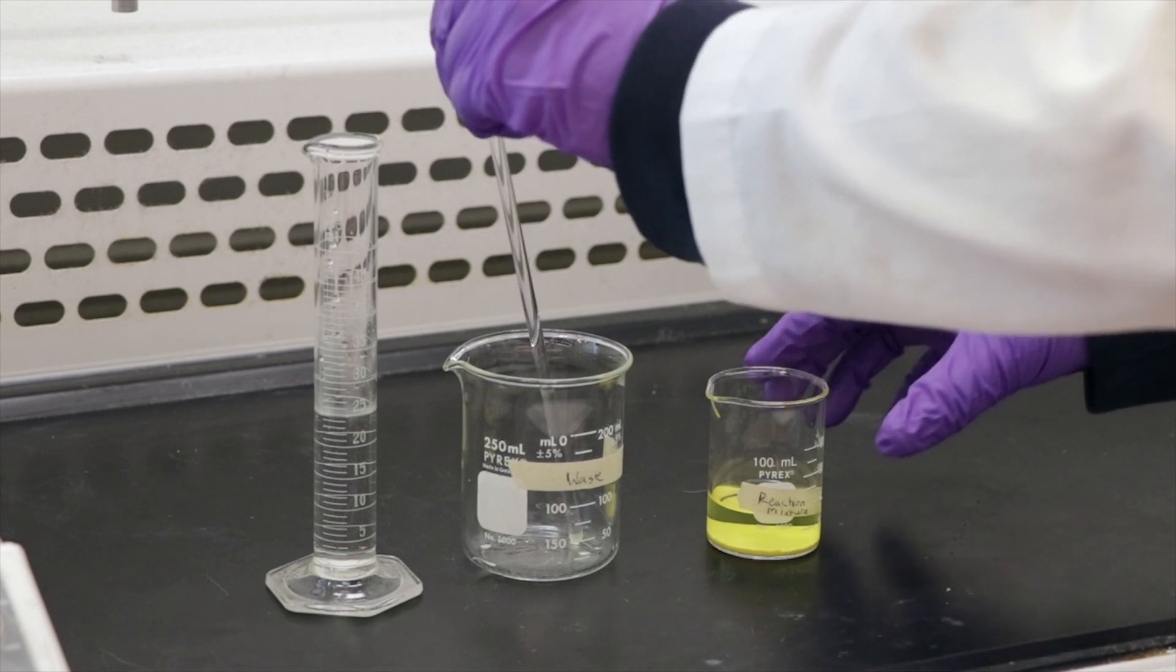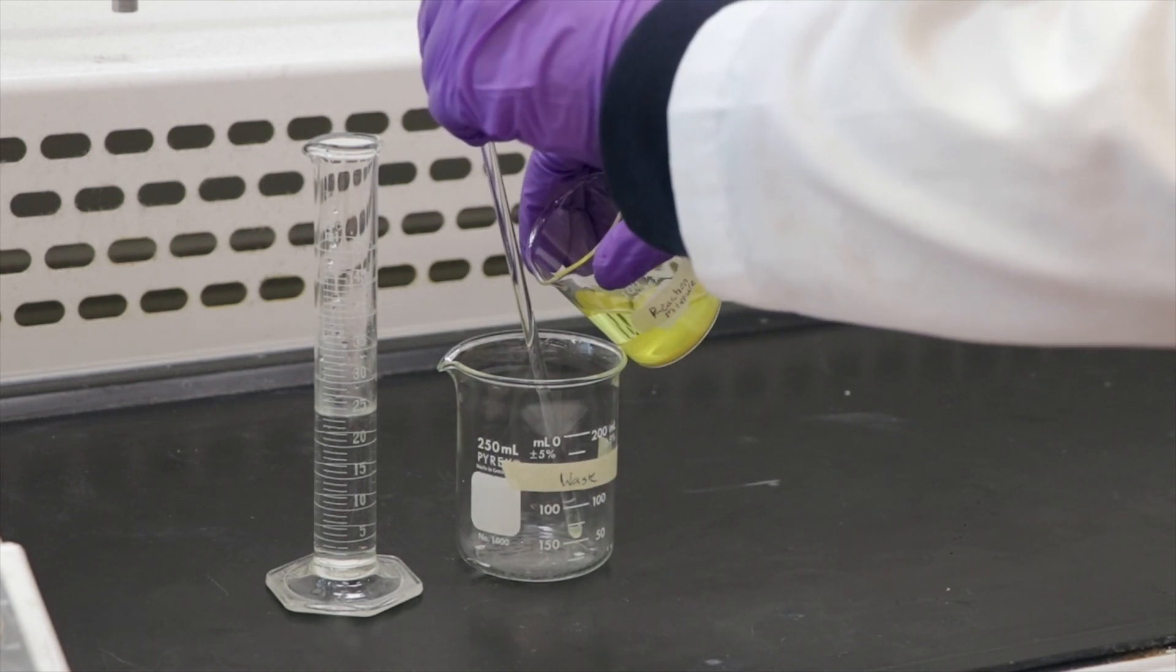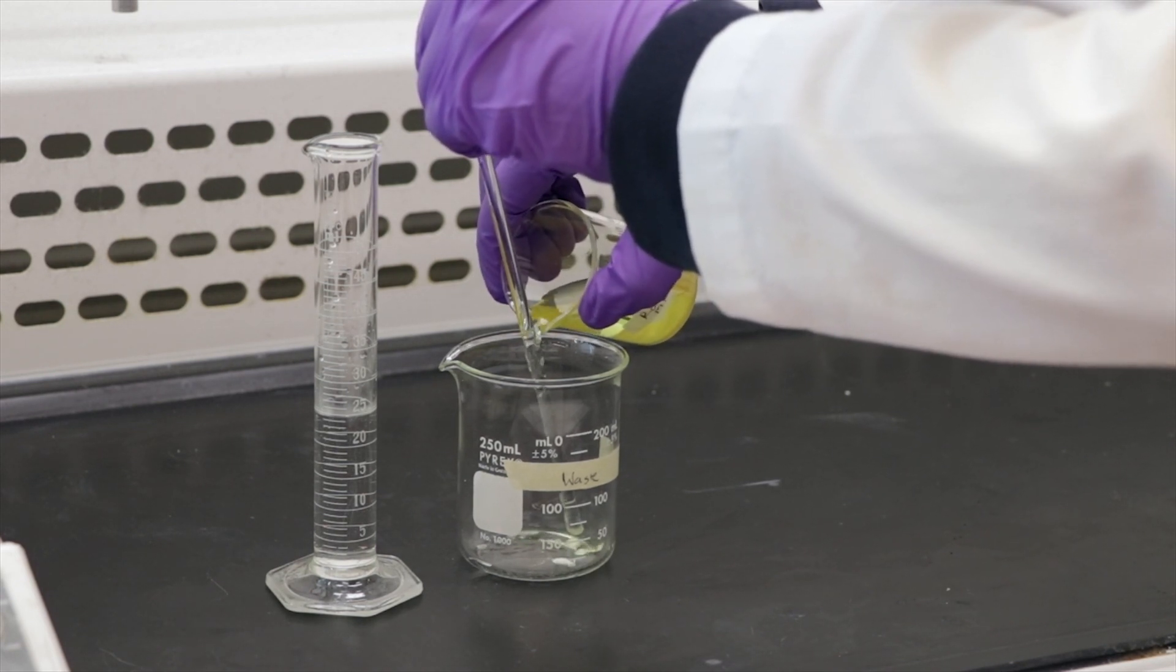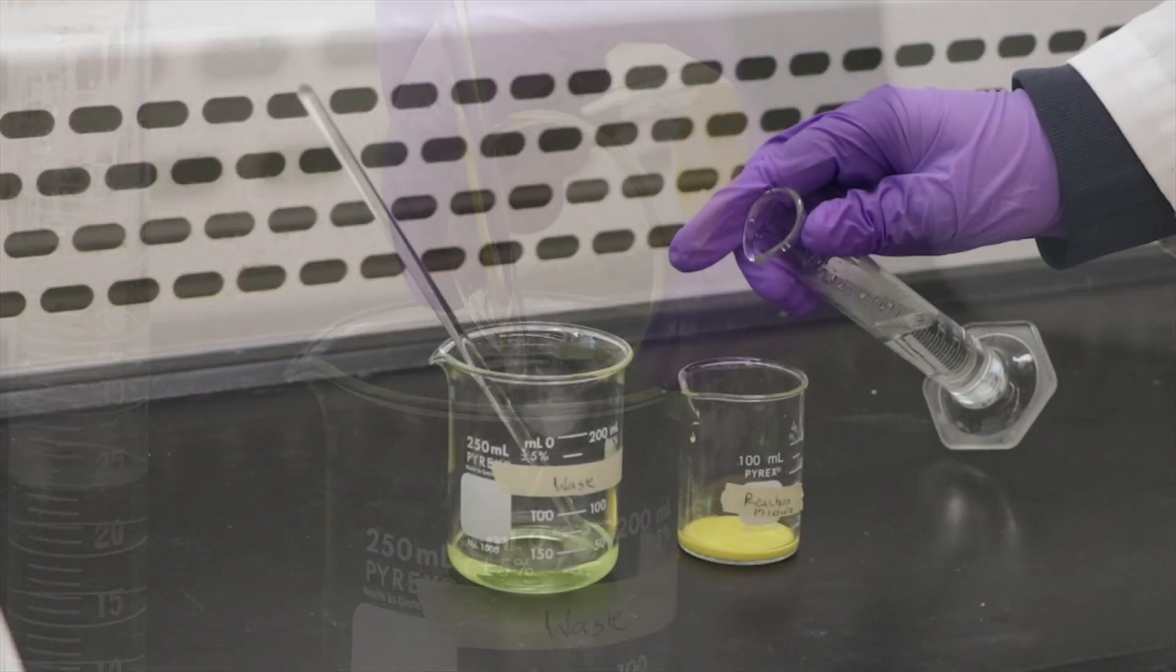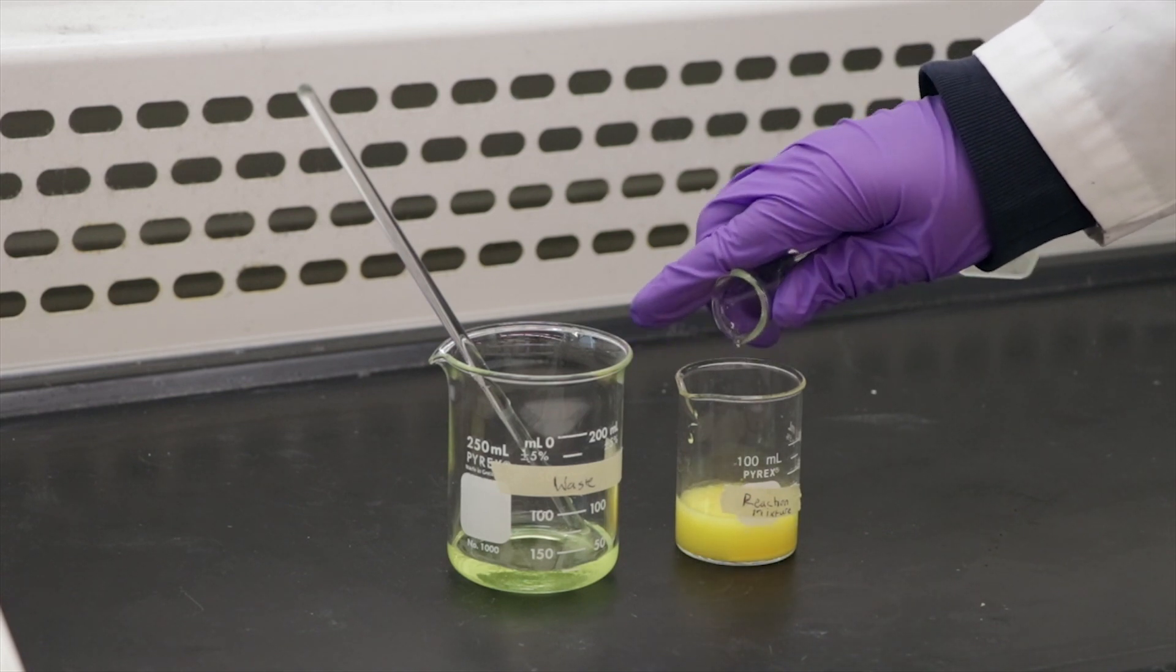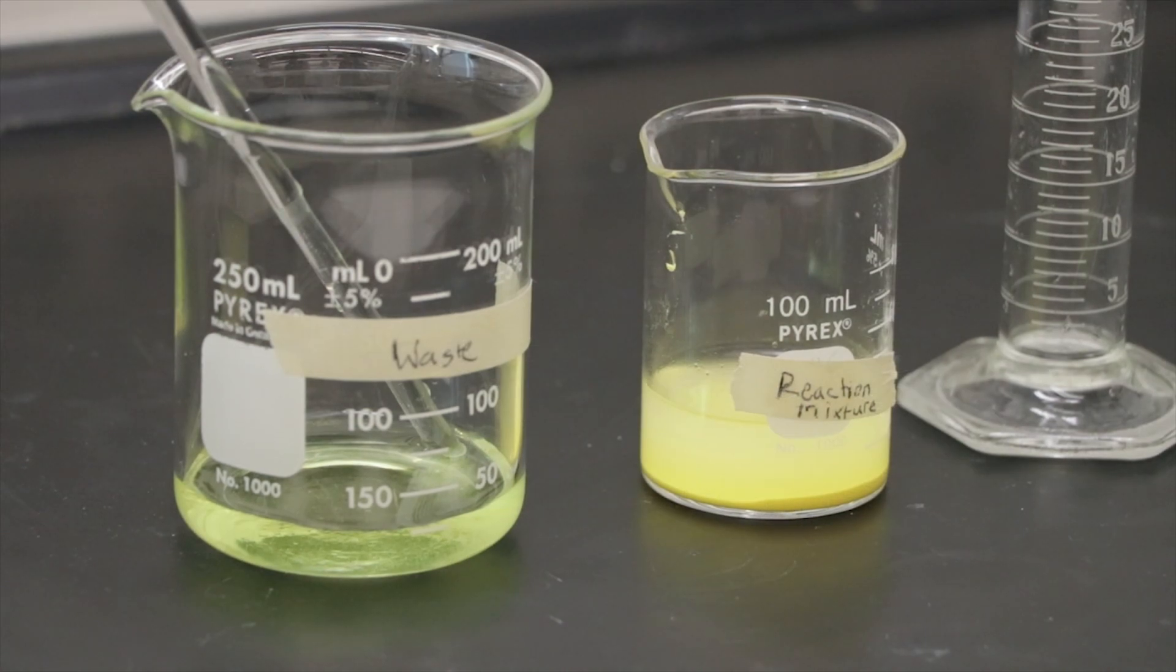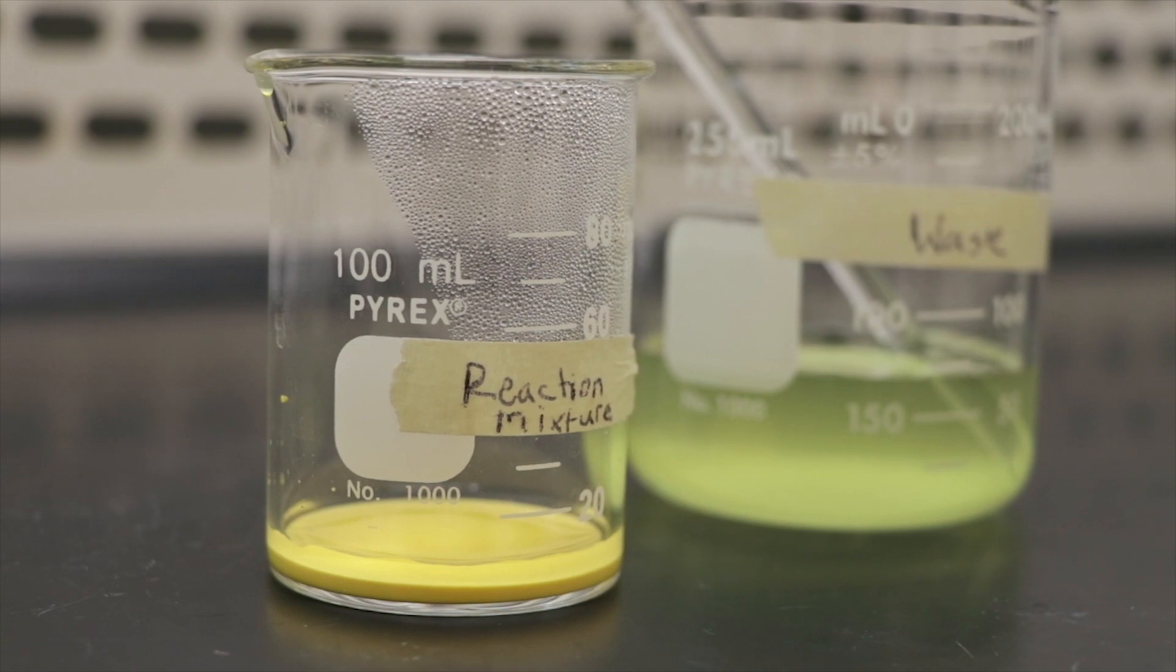Decant the reaction mixture making sure to dispense only the liquid and not the yellow precipitate from your beaker. It's okay if there is still a slight bit of liquid left. After decanting, measure out 25 ml of hot water using a graduated cylinder and add it to your yellow precipitate. Let the precipitate settle again and then decant the solution. Repeat the step once more.